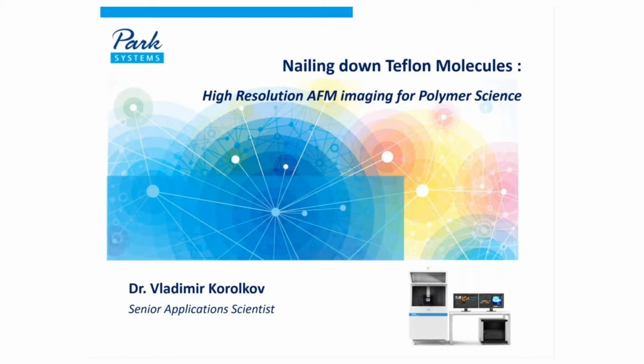He pioneered the use of higher eigenmodes of standard cantilevers to routinely achieve resolution that was previously thought to be exclusively limited to STM and UHV STM. Vladimir has published more than 40 scientific papers, including 3 in Nature family journals. And he left academia in 2018 to contribute to the industrial side of SPM technology. So Vladimir, over to you.